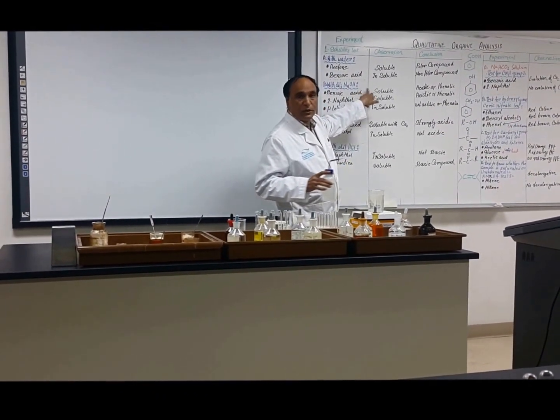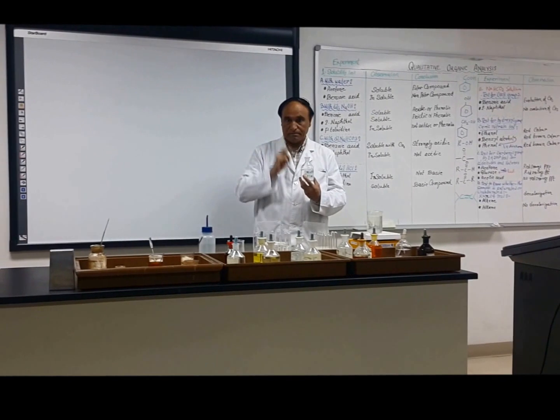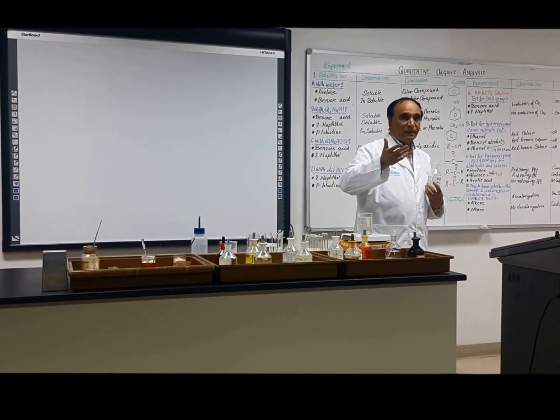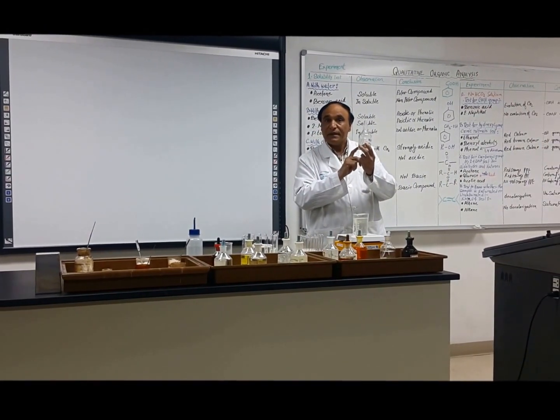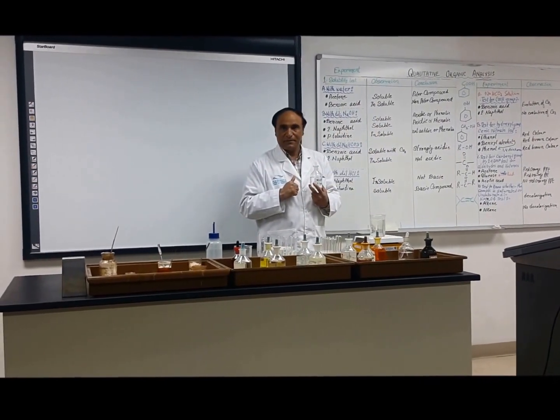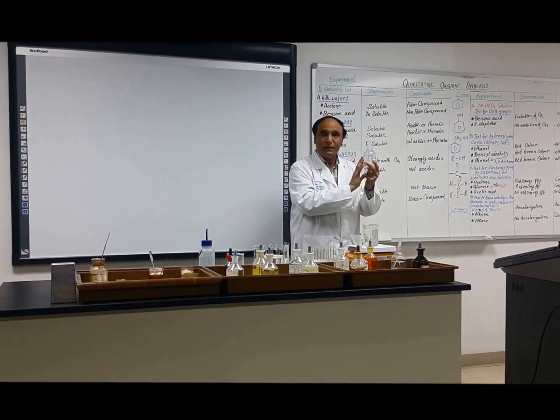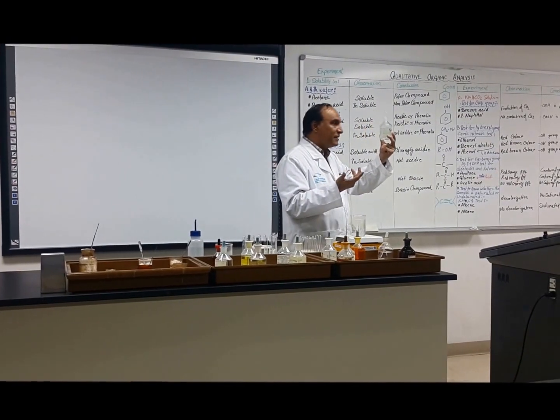Then we will check the solubility in sodium hydroxide. Sodium hydroxide is a base. You know what is acid and base? Yes. Acids give protons, or hydrogen ions, and a base accepts protons. So sodium hydroxide is a base. Any base which dissolves in water is called an alkali. So this is an alkali. It has two names, base and alkali. Because it can accept the proton, it is a base. It is soluble in water, so it's an alkali.